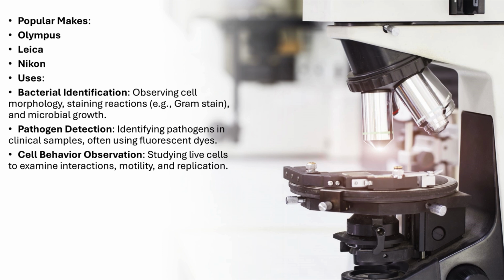Some of the leading brands in microscopy are Olympus, Leica, and Nikon. These brands are well known for their quality optics and reliability in microbiological research. Microscopes are used for a variety of tasks in microbiology. Here's how they help in everyday lab work.